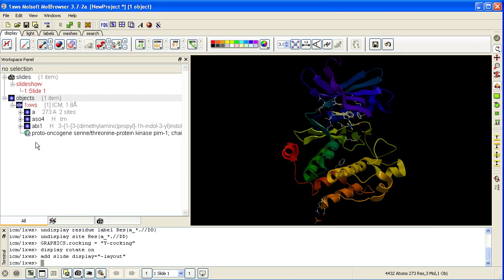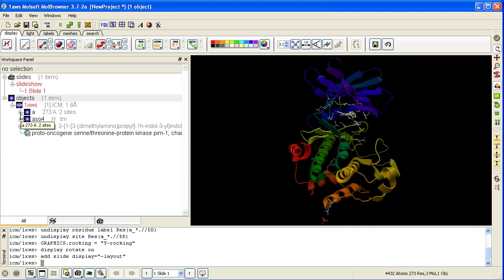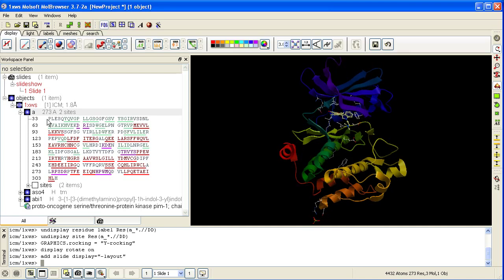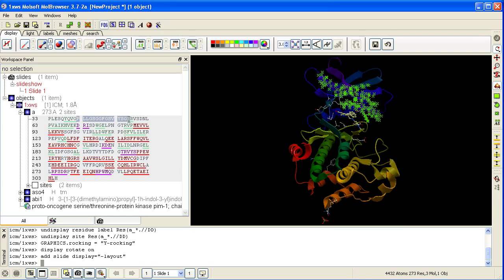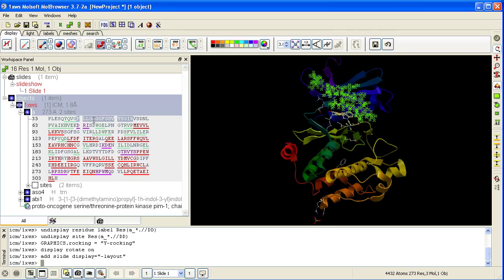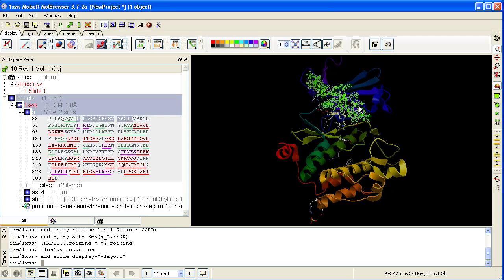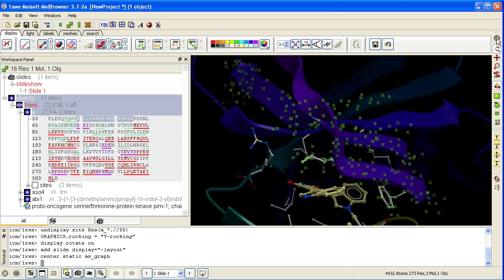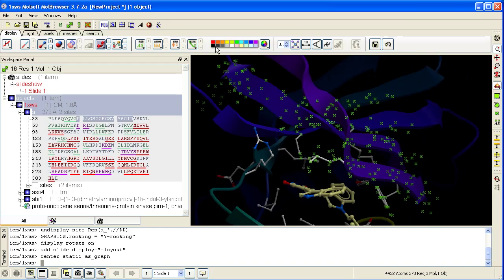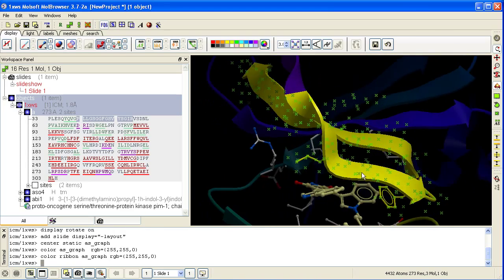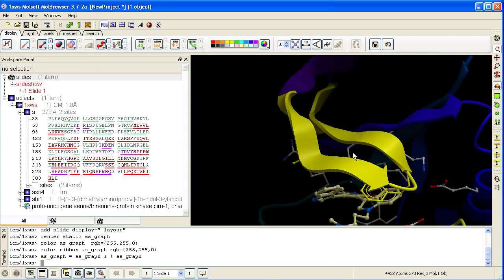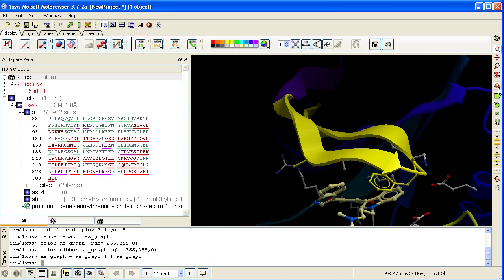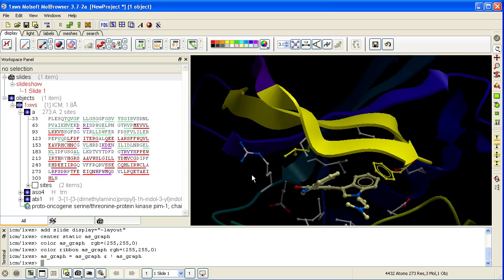The second slide we will make is of the Glycine Rich Loop. Expand here to the residue level and then we can select the residues in the Glycine Rich Loop by clicking and dragging them here. You can see the selection made here is displayed in the graphical display. We will center on the selection by pressing the center button and we will color the Glycine Rich Loop yellow. We will remove the green crosses by clicking here and remove the rocking by clicking here. This is our second slide.